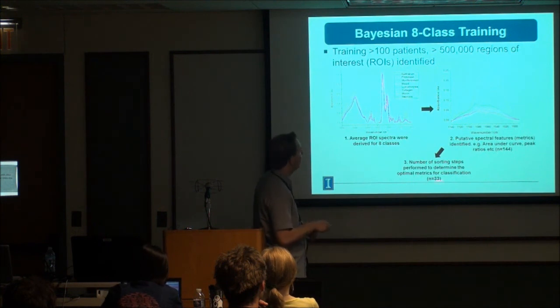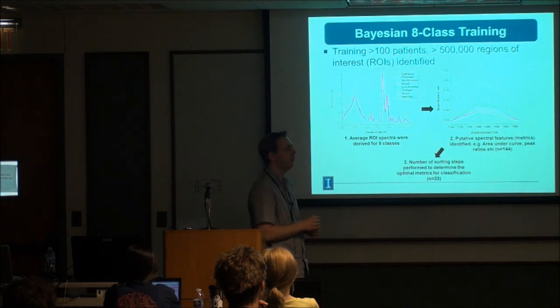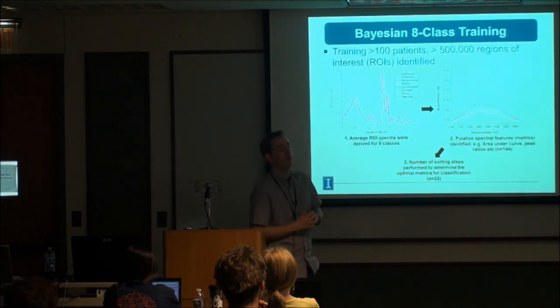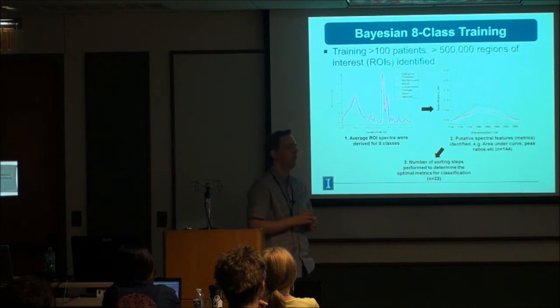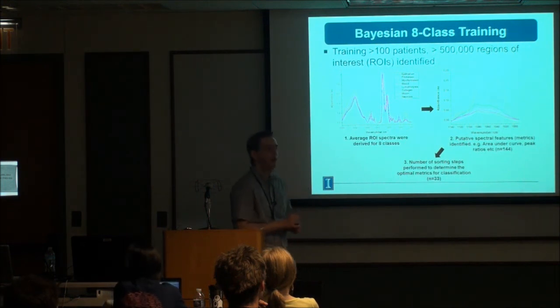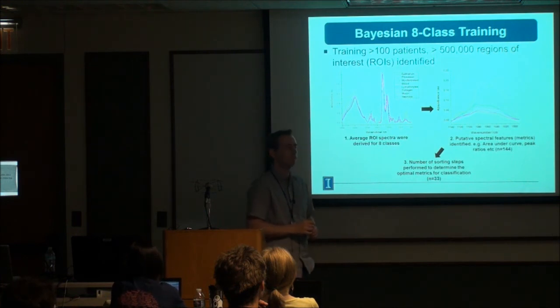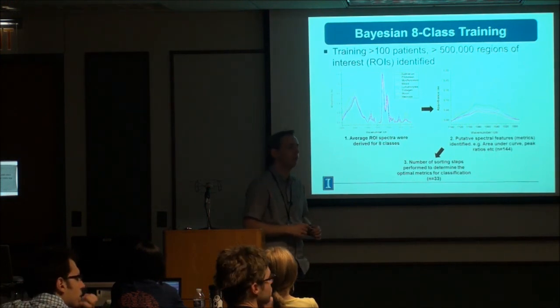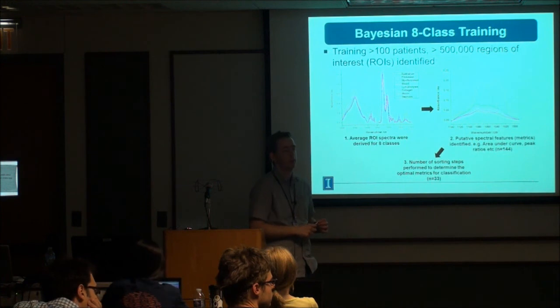33 features, yeah. Actually, this has been refined further. I'm just finishing off the validation. I've got down to about, I think, 18 now. Not yet. We're working on that with a visualization postdoc who's down the corridor. We're talking about doing a random forest type approach. Yes, that's the next step. We're going to be doing that over summer. It'll be much faster.